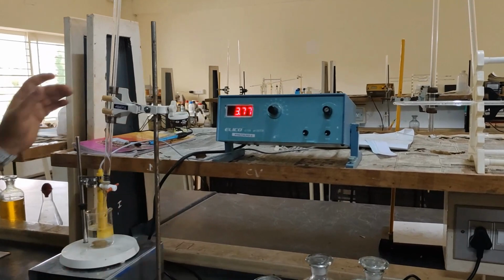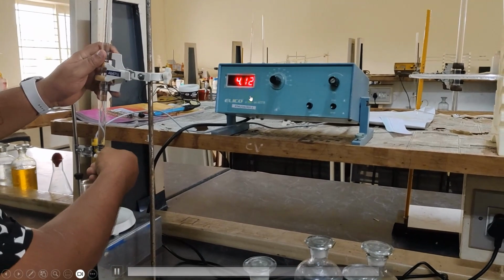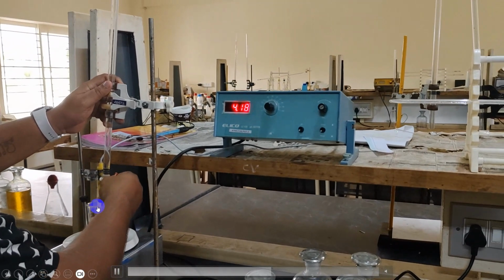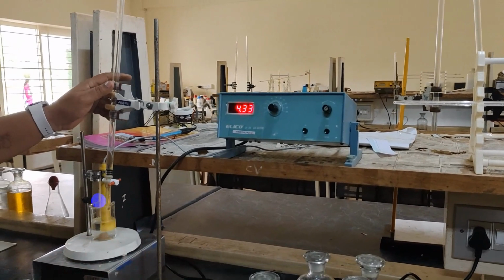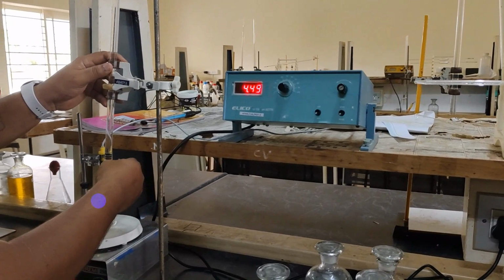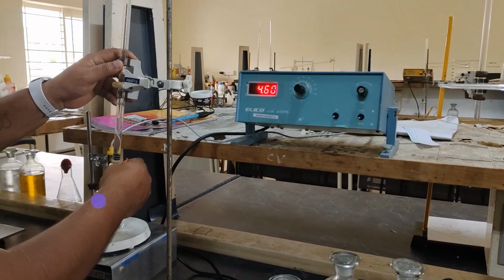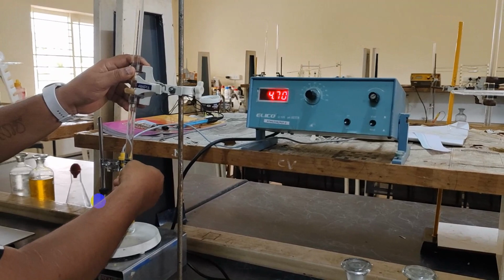For every addition of 0.5 ml, you have to note down the change in the pH. Now, the weak acid inside is reacting with sodium hydroxide to give a salt and water. For example, if you have acetic acid in the medium, acetic acid reacts with sodium hydroxide to provide sodium acetate as the salt and water.